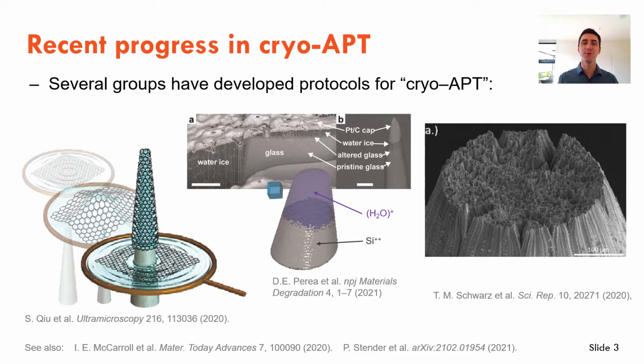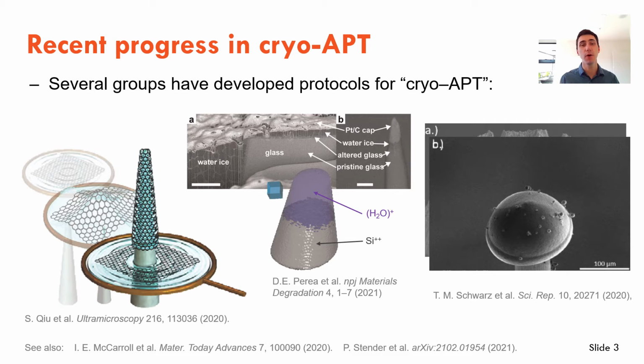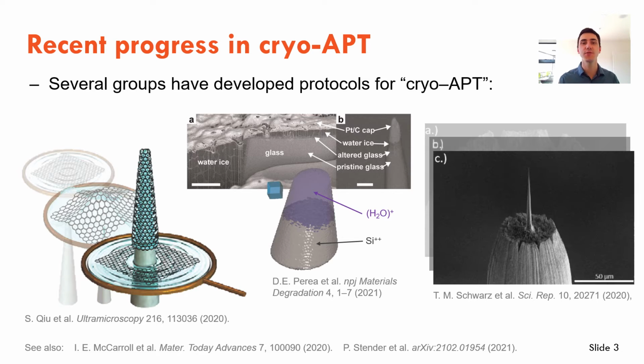The group at Stuttgart cooled tungsten wire to cryogenic temperatures and then fractured it, creating a rough tungsten surface. They then deposited water onto the end and used cryo-FIB to produce a specimen suitable for atom probe. They've also used this method to analyze glucose solutions and other organic liquids, highlighting the versatility of this technique. The penetration of water into pores or onto rough surfaces is important in the second two examples, as the rough substrates are highly wettable for aqueous solutions.